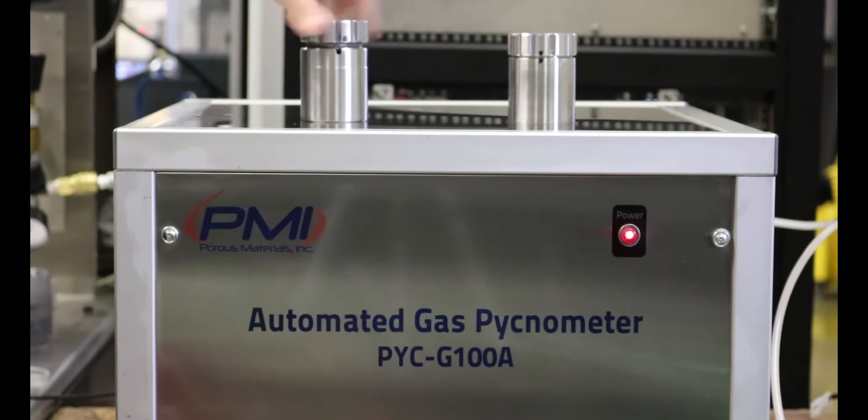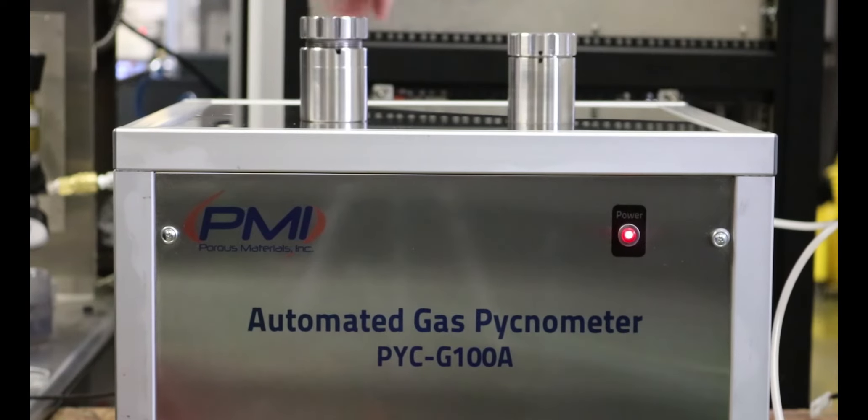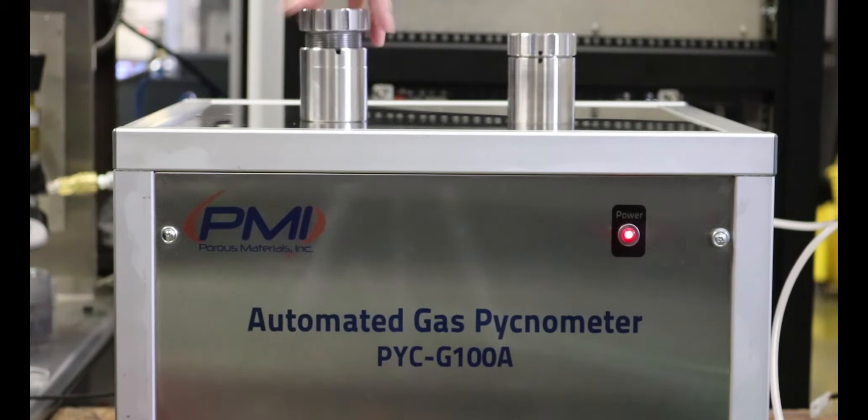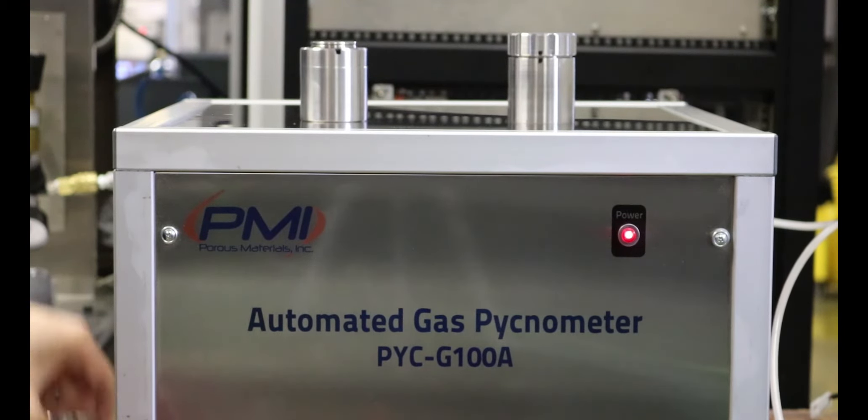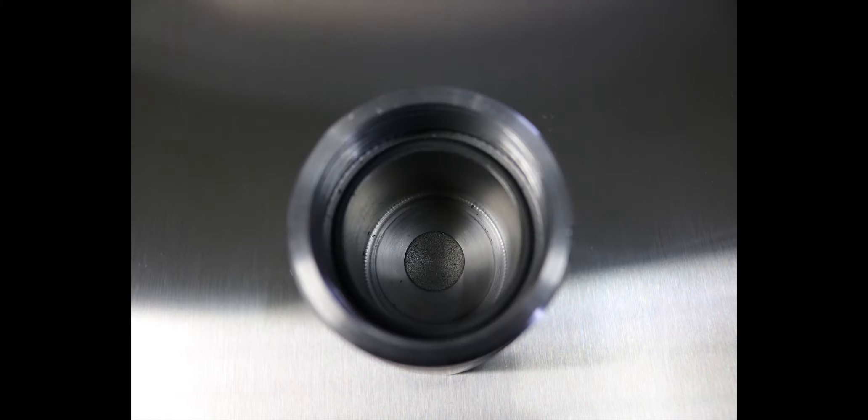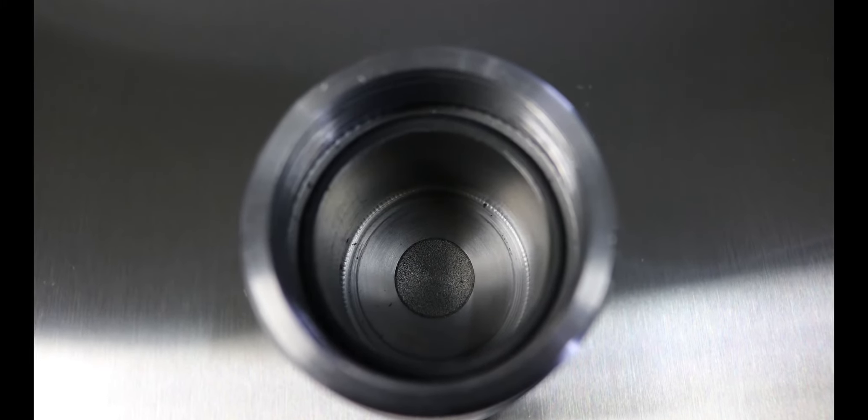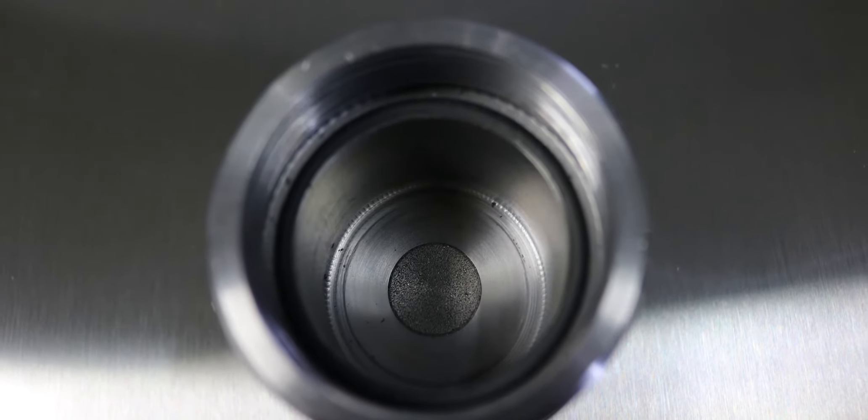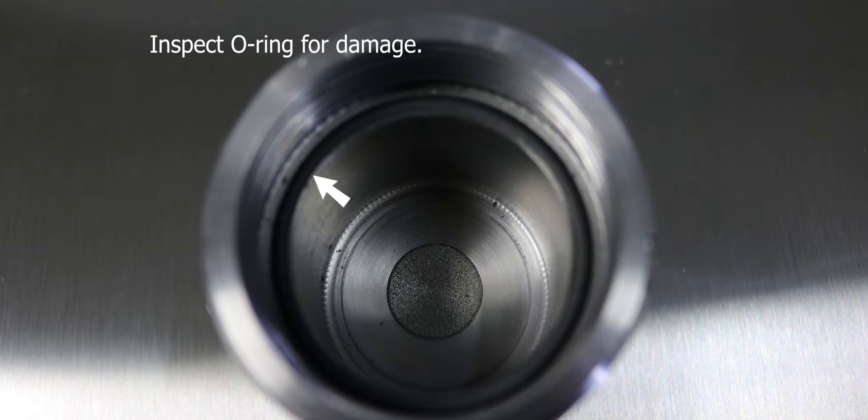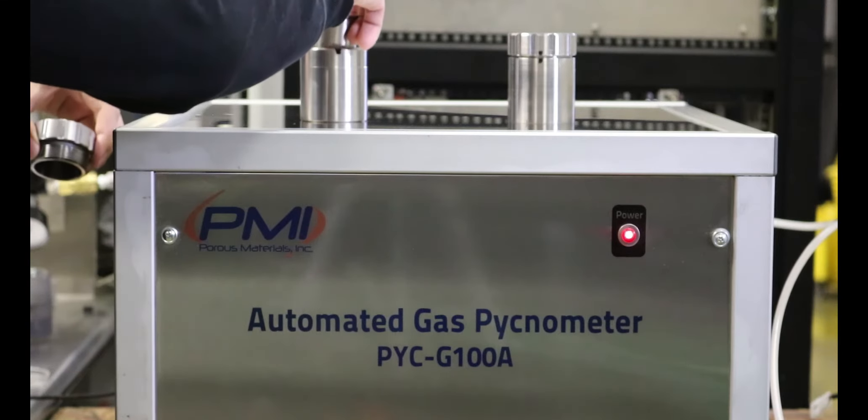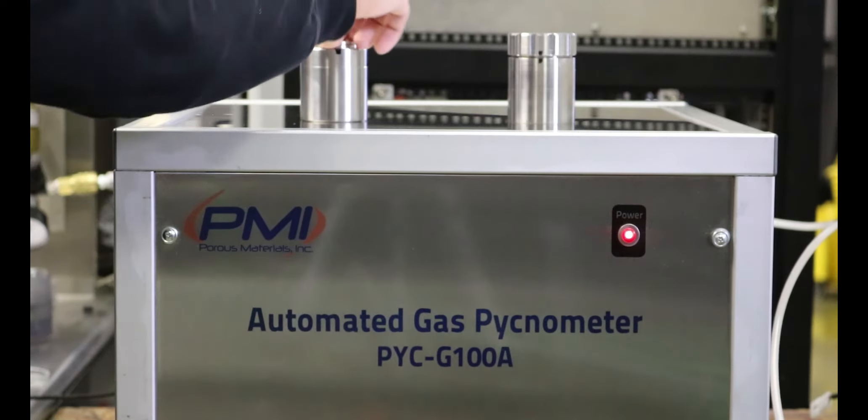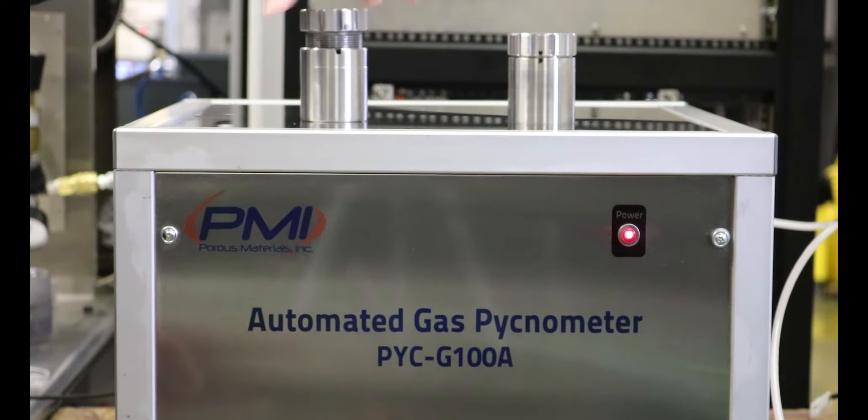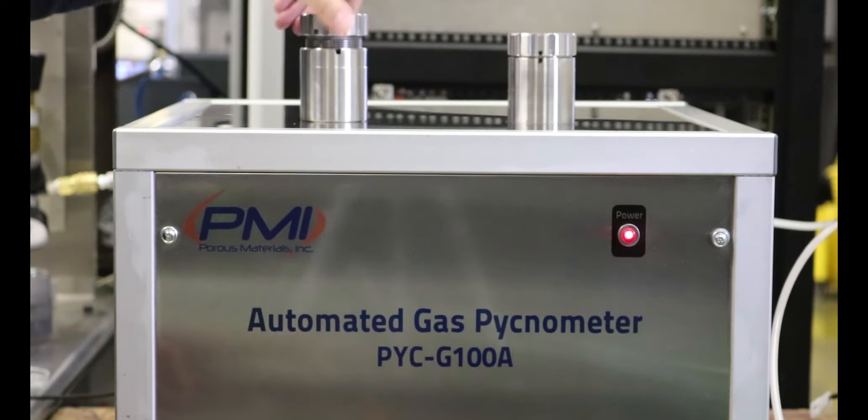Open the desired sample chamber and ensure the o-ring is present and in good operating condition. If any damage to the o-ring is apparent, it will need to be replaced to ensure accurate test readings. Once this is done, replace the cap on the sample chamber and turn until closed.